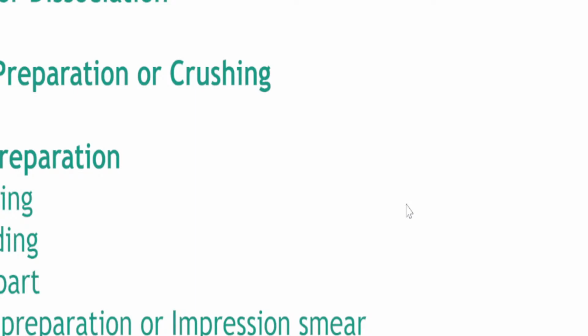So what do you do? You touch it. You basically take a sample from your sample cup, and then you just press it on the slide. Whatever impression it makes, that's what you're going to look at in the microscope. Clear? So far it's clear. Not too fast. All right.